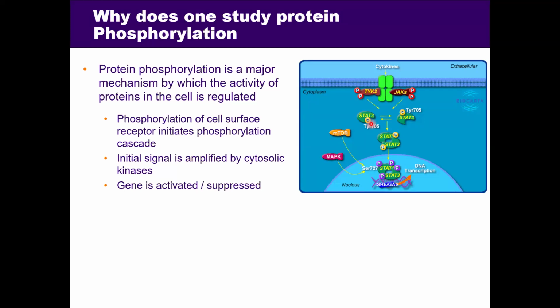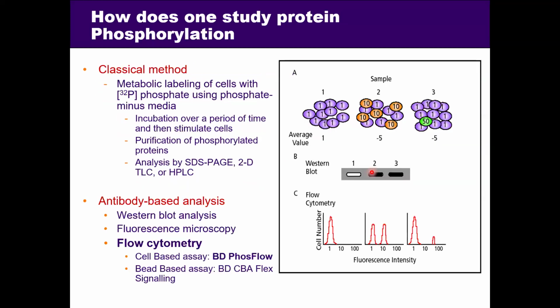When one cell interacts with another cell, at that time the cascade happens, the activation of the cell happens through phosphate. Basically, phosphate is like power, like how ATP comes in, it gives you the phosphate, it activates those cells. All of those things you can find out using your flow cytometer. How? Let me show you.